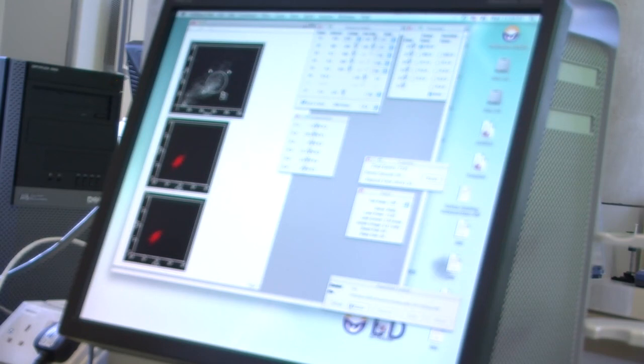You need to speak in terms of internal controls and external controls. So you will need to understand what are the main markers that should be present for stem cells, okay? Which ones you would expect to see and which ones you shouldn't see, which ones you can use as a negative to say, okay, this marker can't be there. So if this marker is not there, then together with our positive controls, we can say that actually the cells are in a pluripotent stage.